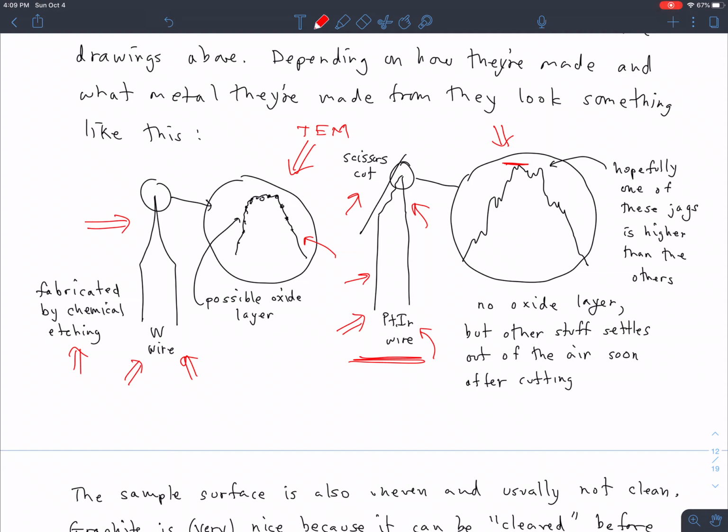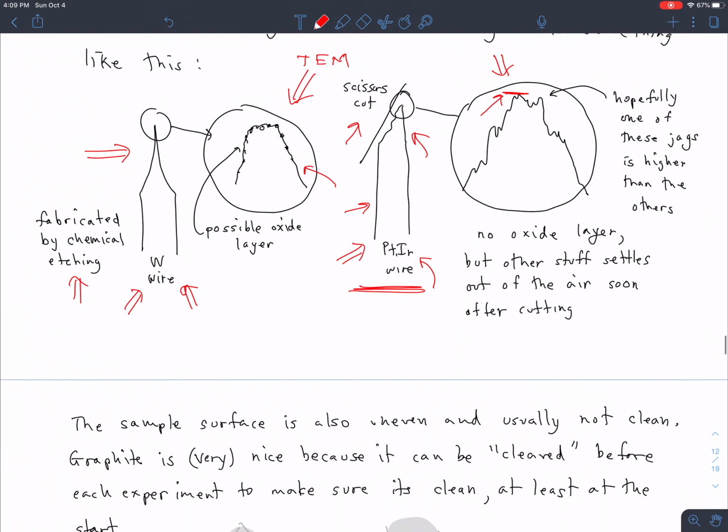Those competing atoms will contribute a little bit to the current, but it'll be 10 times less, or maybe even 100 times less. And so that one single lowest atom can dominate the tunneling current, and that's the virtue of the STM. It means that even just by chance, you're pretty likely to get a tip that's effectively atomically sharp.